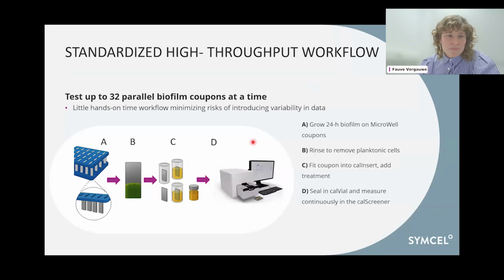So I will just quickly go over the really practical workflow, how you can handle this system in the lab. First of all, you can screw these coupons into the holder plates. And after that, submerge the coupons into a bacterial suspension, where you will allow the biofilms to form on the surface of the coupons.